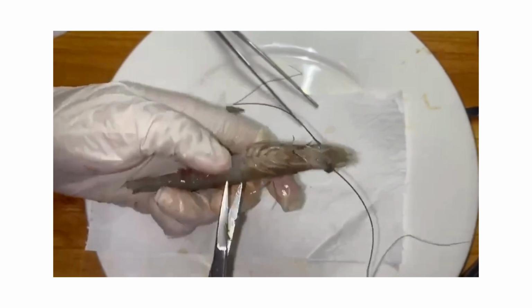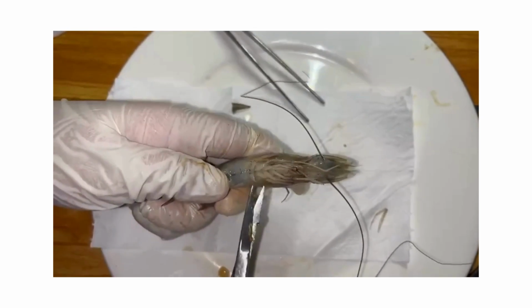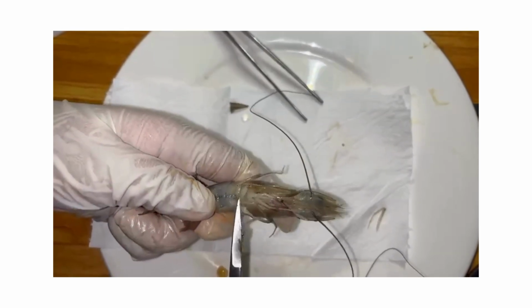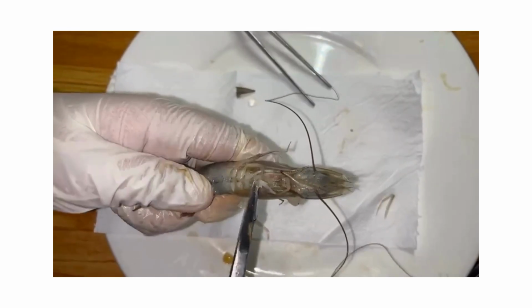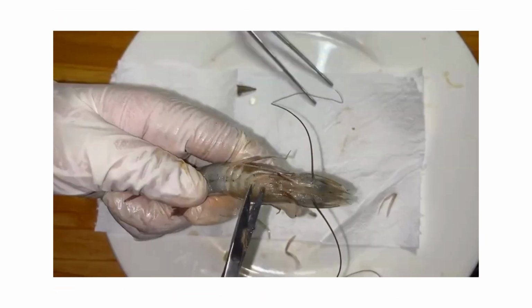Next is the removal of the pereopods. To cut them, the specimen is first positioned with its ventral side facing up. Using fine scissors or forceps, each pereopod is carefully detached at the base where it connects to the body.